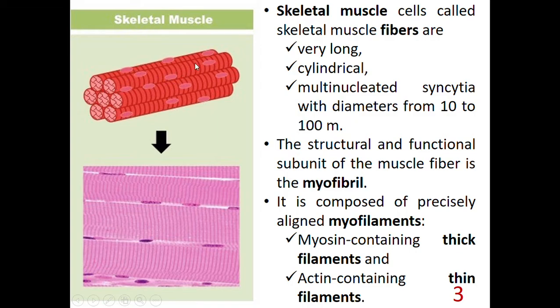Each one has, as you see here, more than one nucleus. So skeletal muscle cells or skeletal muscle fibers are multinucleated cells.